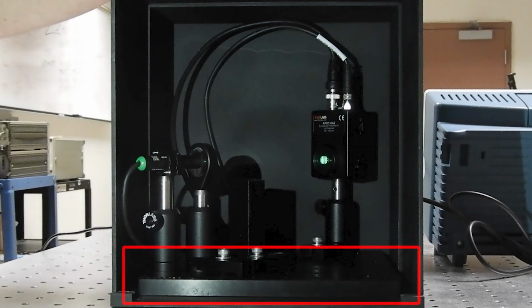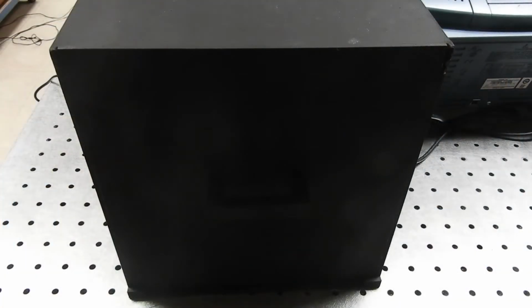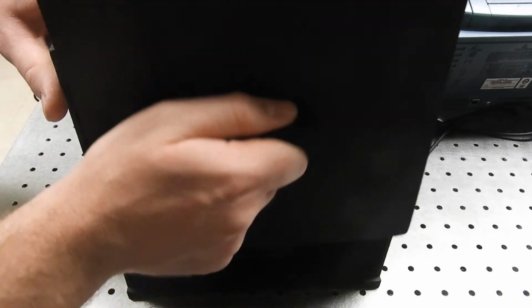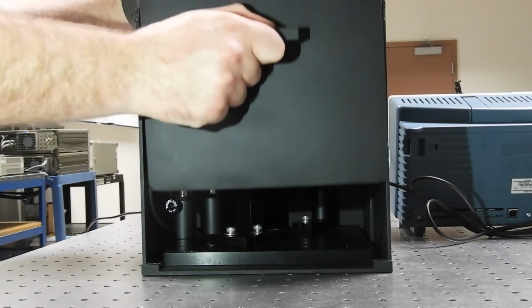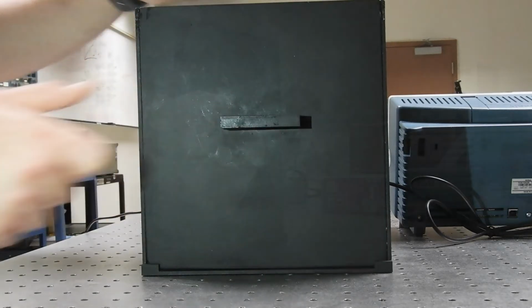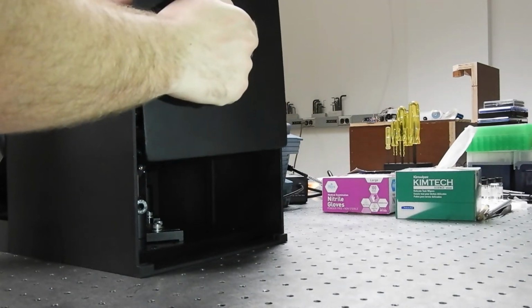These parts are then bound to an aluminum breadboard with cap screws that can be adjusted if movement within the system has occurred. This full assembly is then placed inside of an enclosure and closed off with a system access wall that has been 3D printed using PLA and painted inside and out with matte black to ensure that outside light and reflections do not affect the performance of tests.